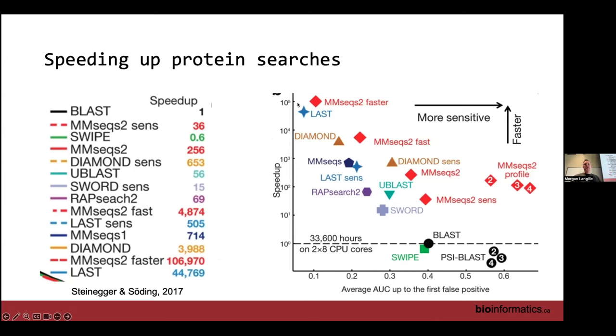You can essentially get a bias in that. Basically, the counting of genes, if you think about core genes especially, is maybe the easiest one. If you count core genes within an average genome size that's larger, then it'll look like a smaller count. So you could have the same amount of core genes in both of these types of samples, but because the average genome size is larger, it looks like a smaller proportion of the total amount. Didn't do a bad job with that, considering no graphics.